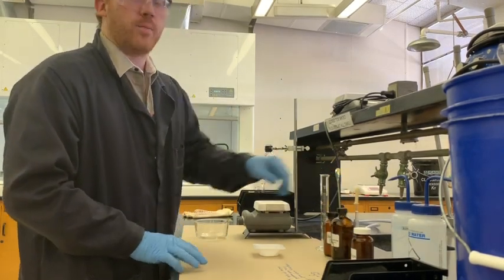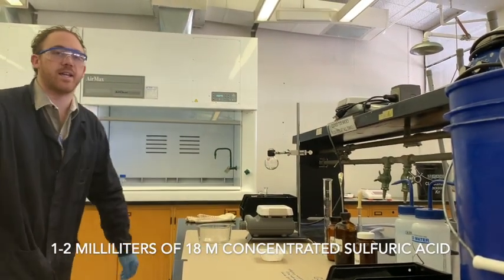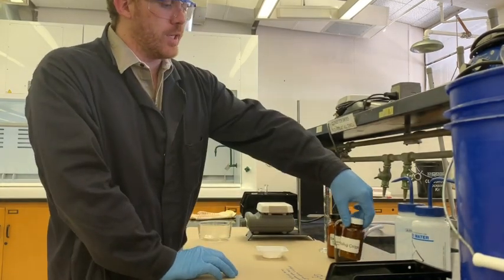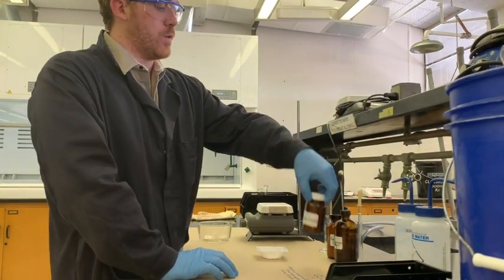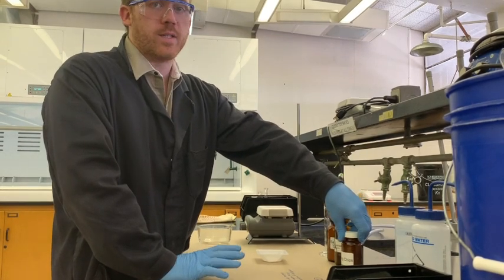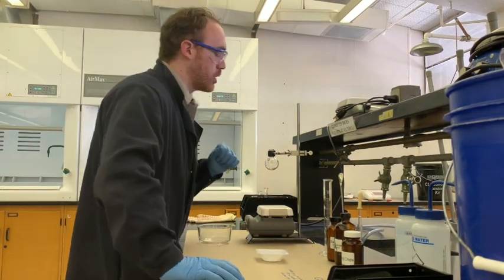We're going to be using a little bit of catalytic sulfuric acid - 18 molar or concentrated sulfuric acid - which is over in the hood. We're also going to put some boiling chips in there to prevent any bumping by creating nucleation sites for bubbles to form, because we're not going to add a stir bar to this reaction.